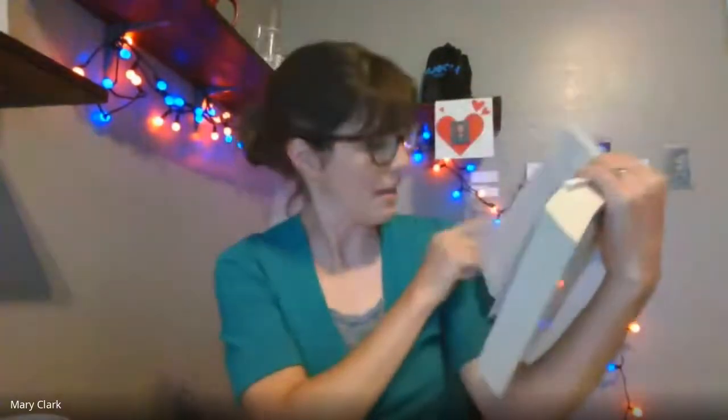In all the labs that we are doing, we need to focus on a specific piece of DNA. In many cases, that's going to be a gene. One analogy is a book. Let's say your whole genome, all of your DNA, is like this big book, right? But for the labs that we're doing, we only need maybe this passage on page 42, but maybe another group is interested in a passage on page 385. So we need to be able to focus our attention just on the specific piece of DNA that we need.